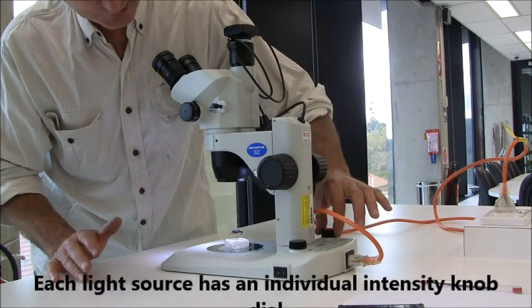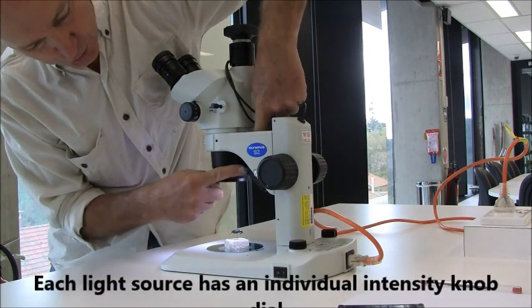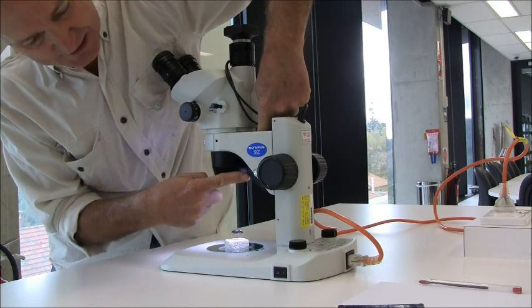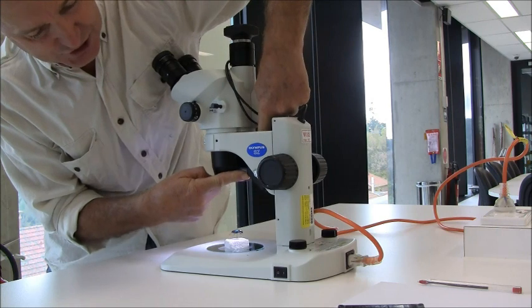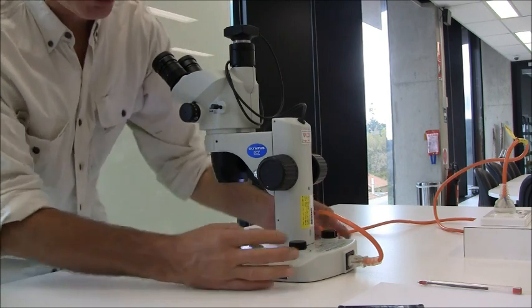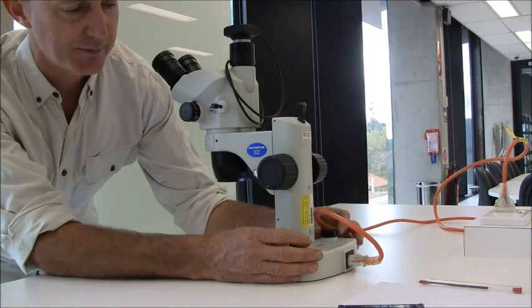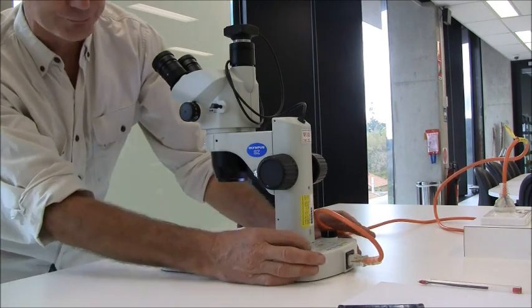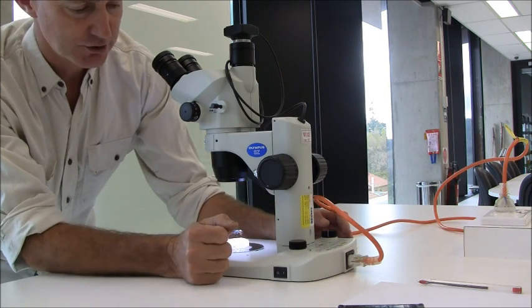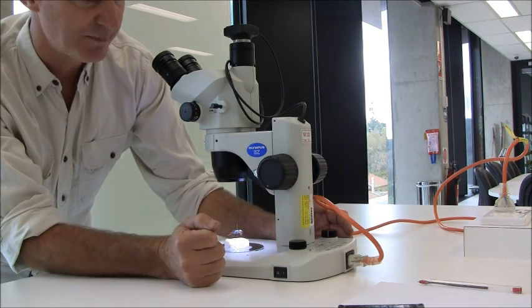One more thing about the light from the top: you've got to poke your fingers down inside here, and there's a little bank of LED lights that you can direct like a stage light onto the specimen. You're in control of this light — you can use a little bit from the bottom and a little bit from the top, or all from the bottom, or all from the top. You have to fiddle with it to make it work best for you.